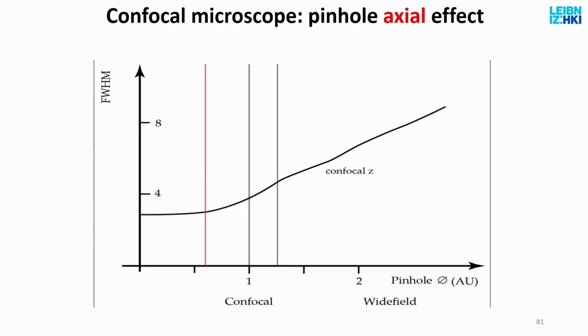Or you have polymer molecules, supramolecular structures. With STED, you don't see the structure anymore. You see the substructure. And then you need a confocal image to know where you are. So then what you do is, it's the same microscope anyway. So you take an image in confocal mode and you take an image instead on the same sample, you don't move anything, you switch a button.